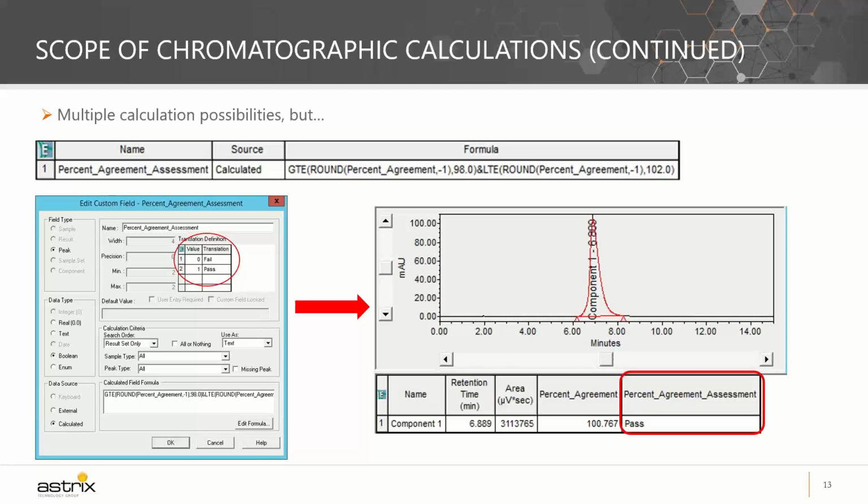So chromatography is just one of the many techniques you will find in a typical lab. So that means that other instruments are being managed outside of Empower. So the system that controls these other instruments could potentially not have the same tools as Empower. So you would need to have a separate system to do this final specification evaluation anyway. So my point here is that you could be putting in too much time and effort into something that will not solve all your problems.